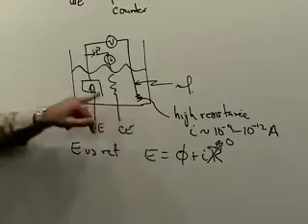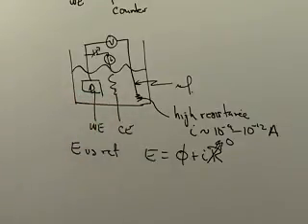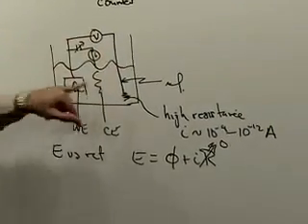This R is the solution resistance here. Well, plus the frit. Yeah, I said solution. I should be more careful. It's the whole cell resistance. So the frit would be in series with the solution.